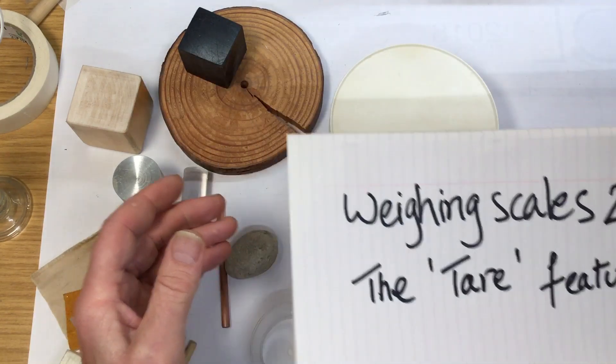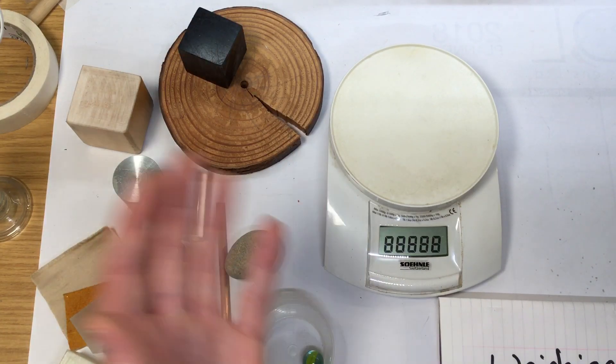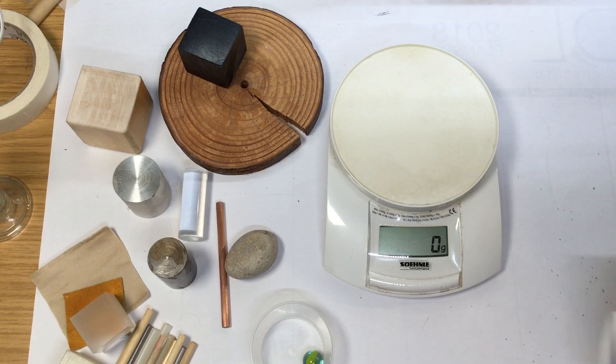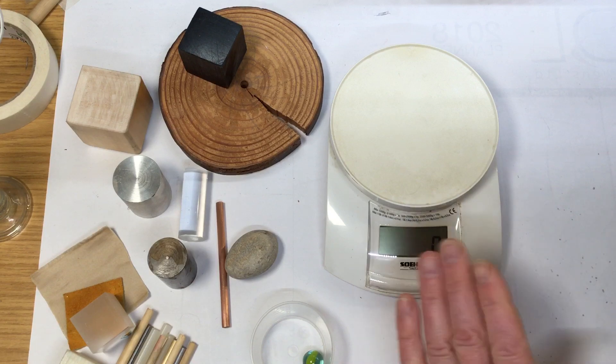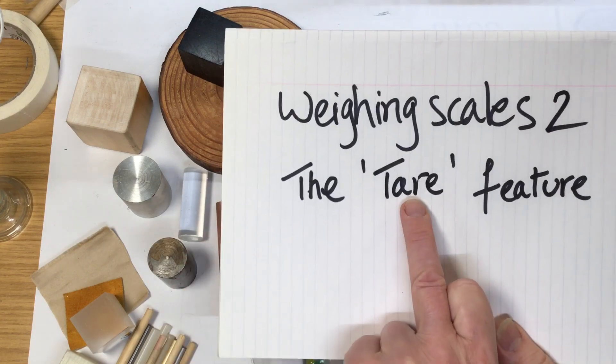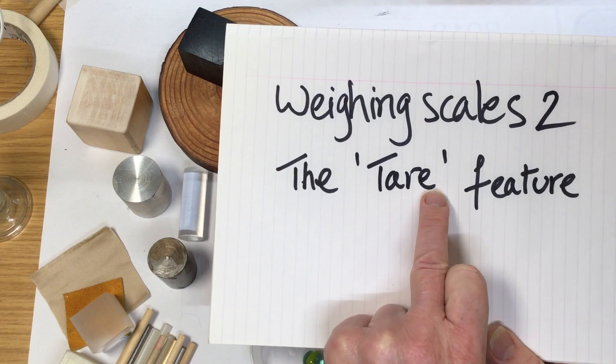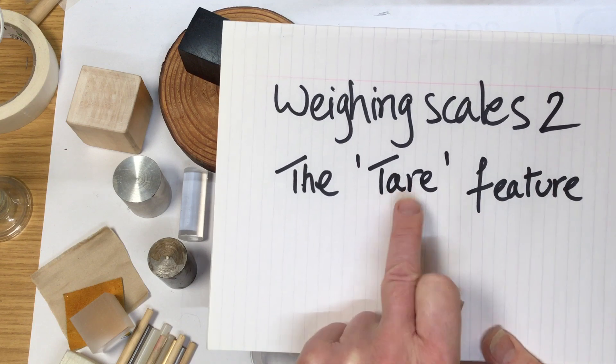Right, in the last video we looked at the scales - press the button to reset, turn it back off again. This one's got a timer so it turns itself off, but there is a strange feature which is very useful, a function called the tare feature.